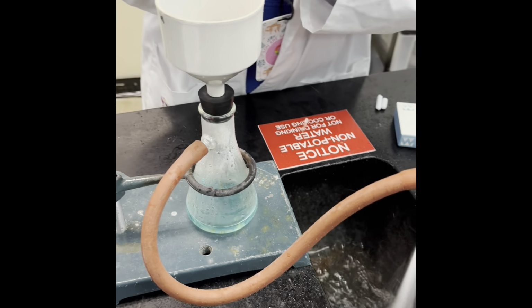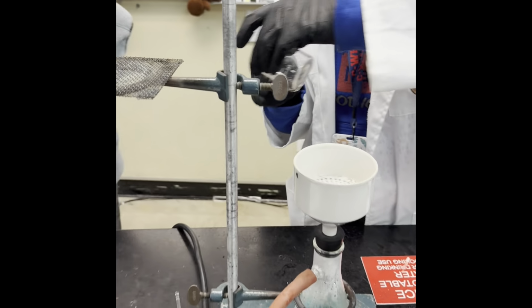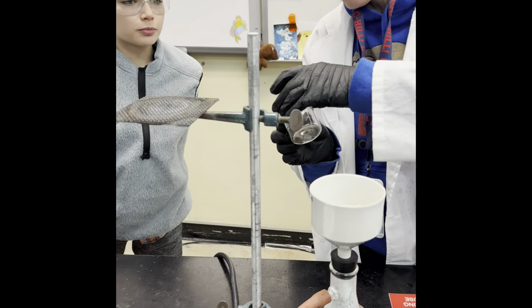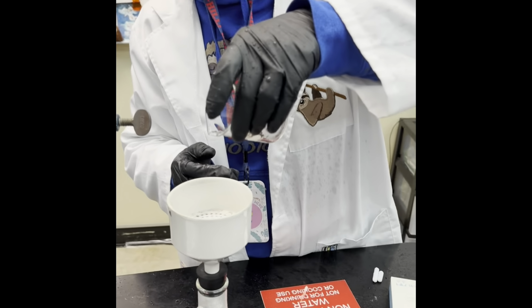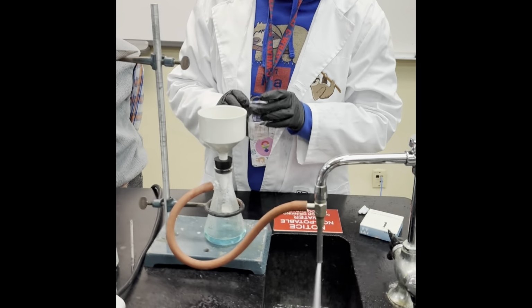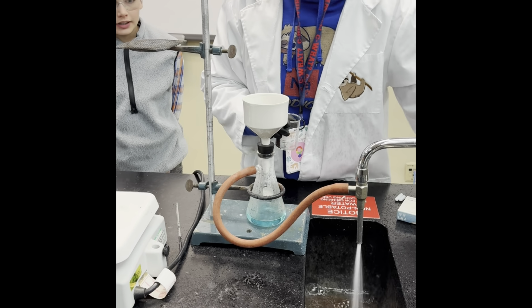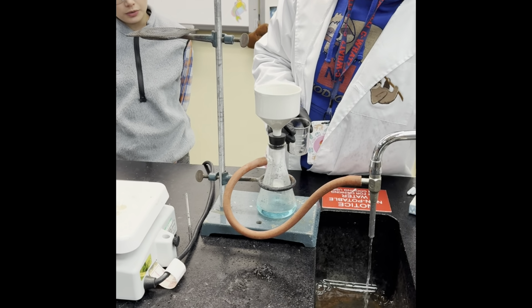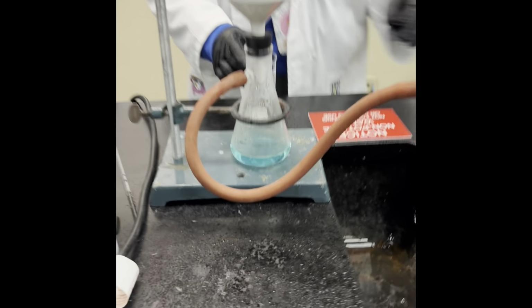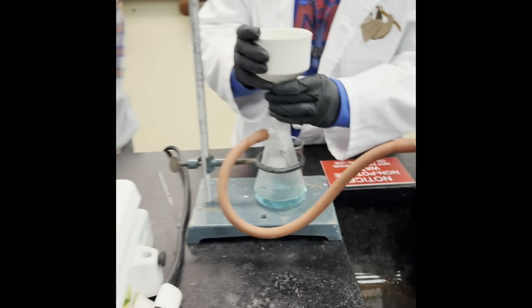So if we look in there, what color do you notice, Cooper? What color does that look like? Brown, like dirt brown. Kind of dirt brown, reddish. Yeah, I would agree with that. Maybe a little copperish color. And now the water in there is blue. Yeah, so that filtered out all of the water, which is super cool.